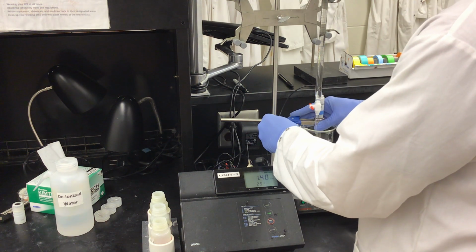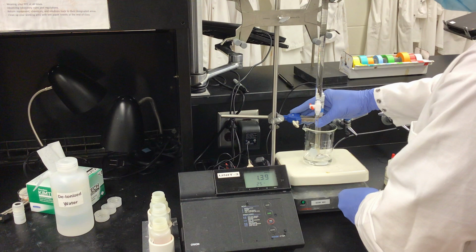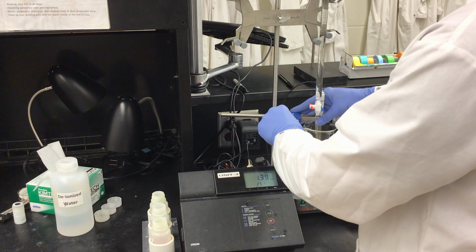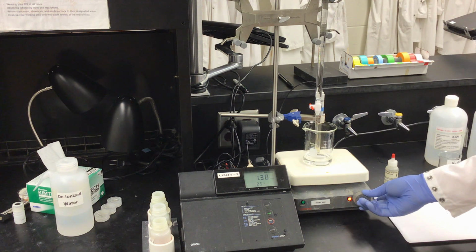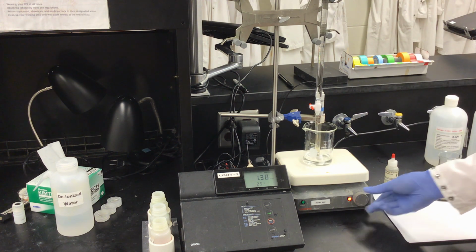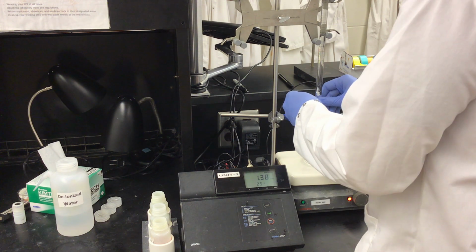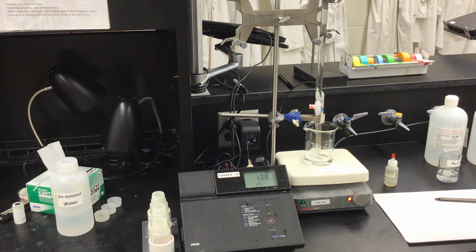Now I will bring my pH probe back up away from my solution, check to see that it's not getting hit by my stir bar. It is, so I'm going to raise it a little more. And now I can begin titrating. Every 2 milliliters of sodium hydroxide that I add, I will want to check the pH again. So I will slowly open my stopcock, and I can add 2 milliliters. As you can see, there is no color change from our indicator, which shows that we are still acidic.